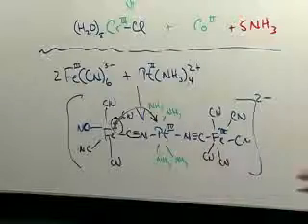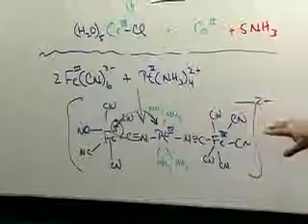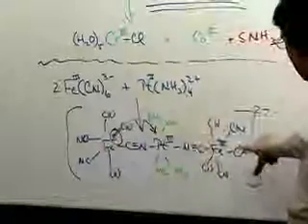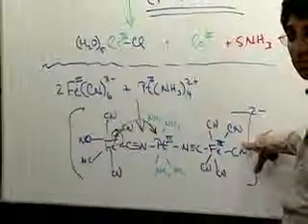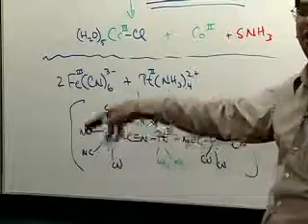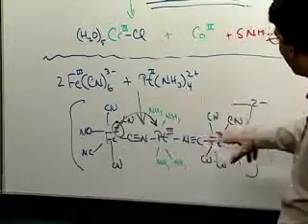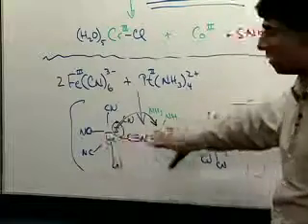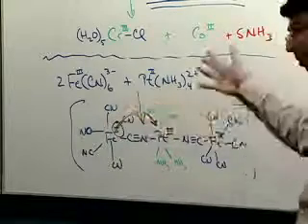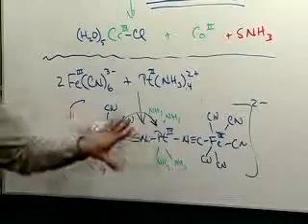Now, by the way, if you take this complex and you run a cyclic voltammogram on this, just to get back to electrochemistry for a minute, in fact, you see a single oxidation, and in that oxidation, there's 2 electrons. That is, the wave is twice as big as you'd expect, 30 millivolts peak-to-peak separation, approximately. Well, actually, under 60 millivolts peak-to-peak separation is what I should say to be technically correct. And that indicates that's an oxidation for the 2 irons, and that this structure in between insulates the 2 irons from each other so that one of them does not know that the other one is oxidized. And you would expect that actually based on the molecular orbitals that are involved here.